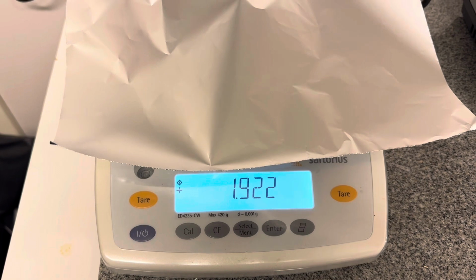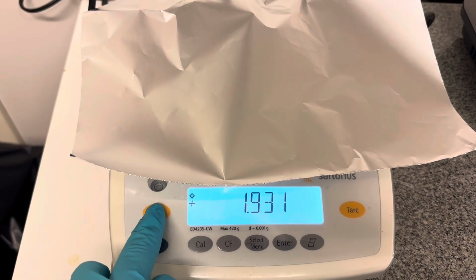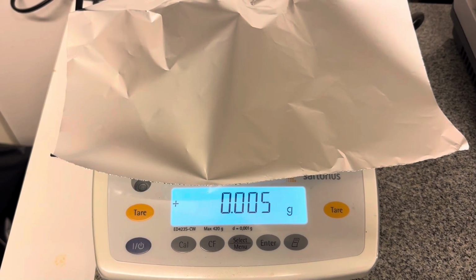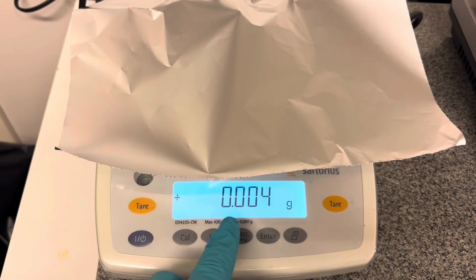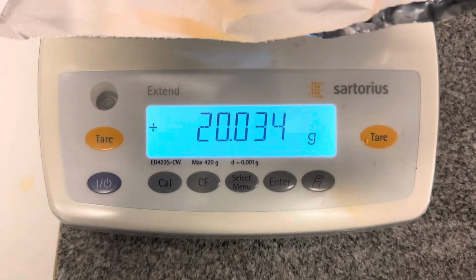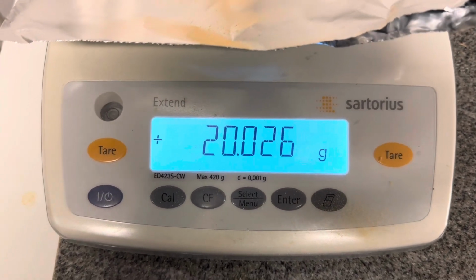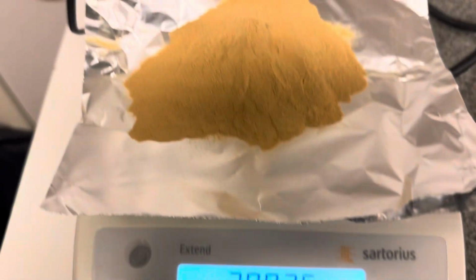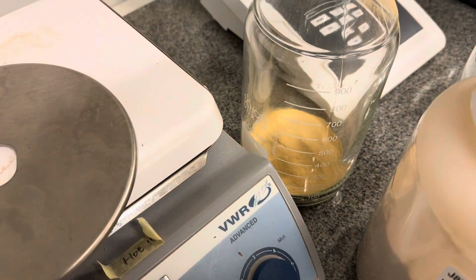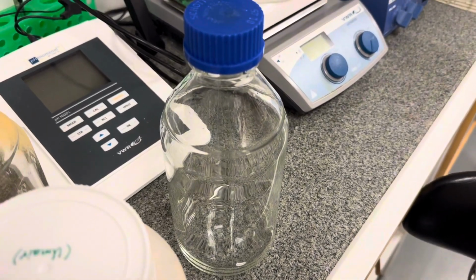So what we have to do, we have to press this button. Here it is Tare. So now you can see that when we press this, it reduces the weight to 0 grams. So actually we are going to prepare 2% malt extract, and now I have measured 20 grams of malt extract, and then I will be pouring this into these bottles. Like this one is empty, so I'm going to put it here.